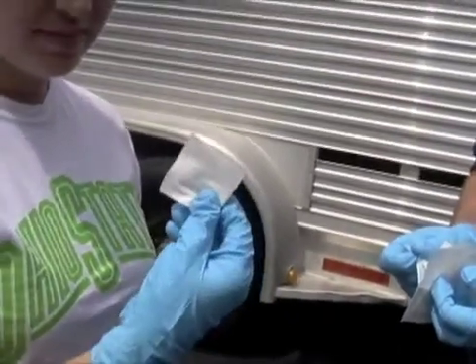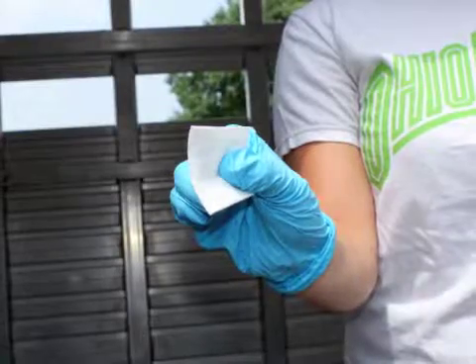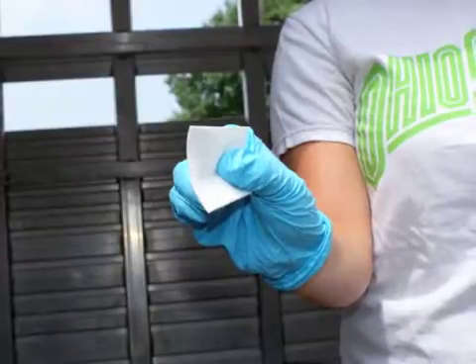Hold the wipe in one corner between your thumb and index finger. Allow the rest of the wipe to lay across the remaining fingers.